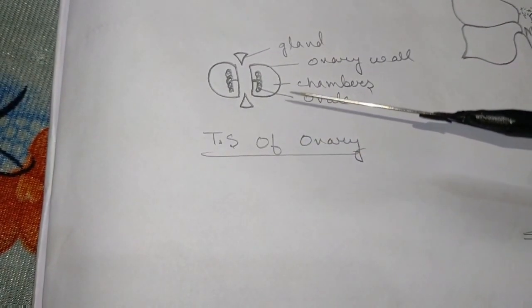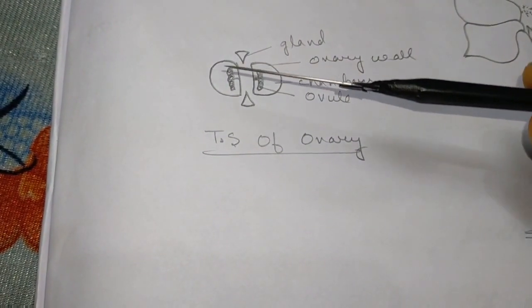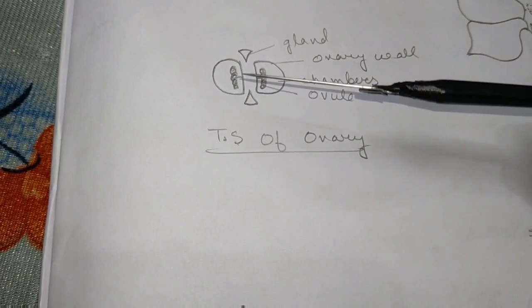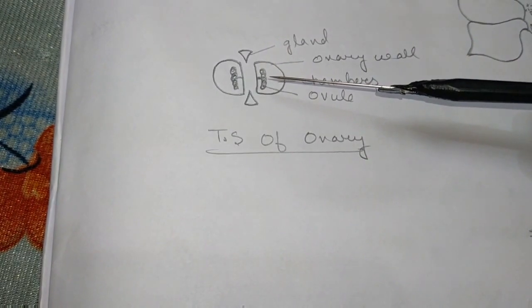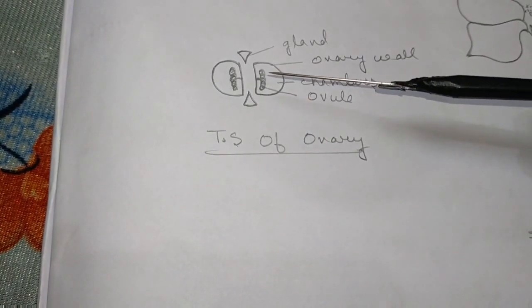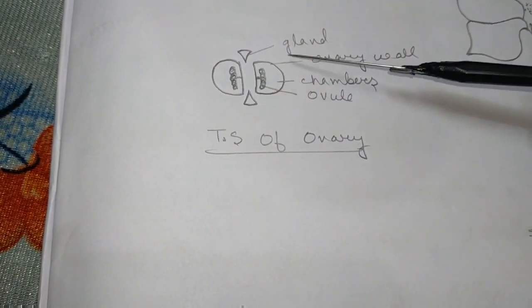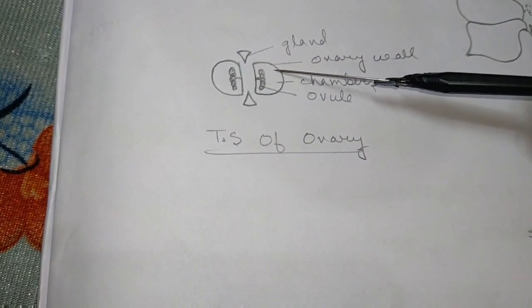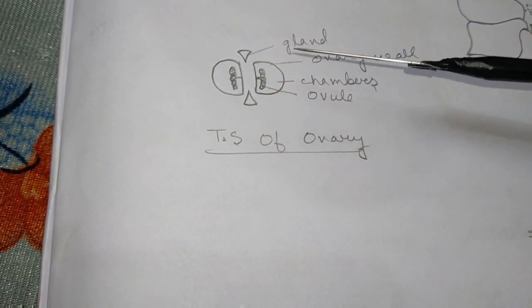This is the transverse section (TS) of the ovary. When you observe under the compound microscope, you will get this image. There are two chambers, so it is called bilocular — two chambers are present. This is the wall of the ovary, these are the ovules, and this is the chamber. So it is a bilocular TS of ovary.